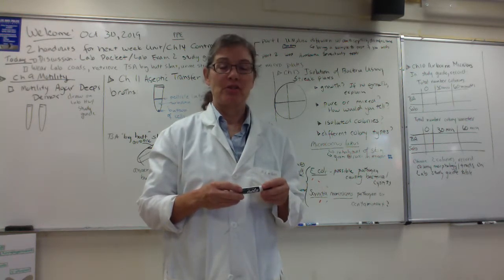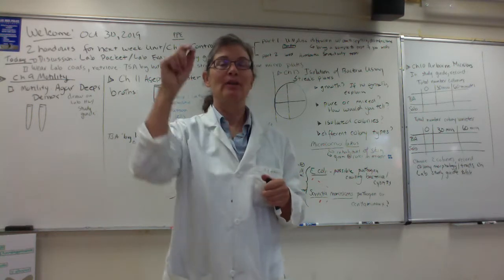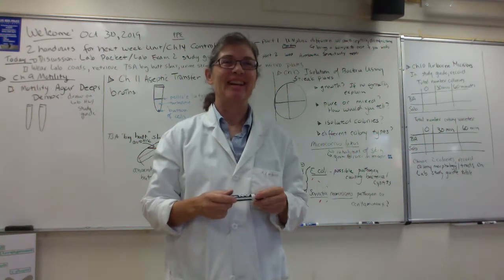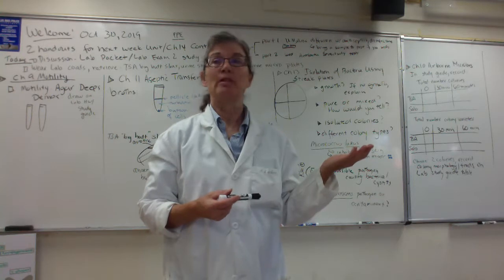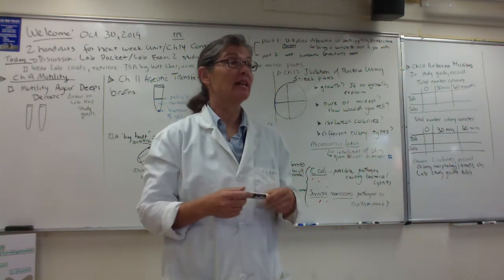What if, you're going to laugh at this, you guys, what if you missed the microbes? Remember how we gave you the E. coli plates? What if you harvested cells from agar where the E. coli weren't? You literally missed the cells. Is that a possibility? Yeah, probably not a great possibility. What if the pure culture we gave you, what if the bacteria were dead? Is that a possibility, right? And that you have no control over that, right?